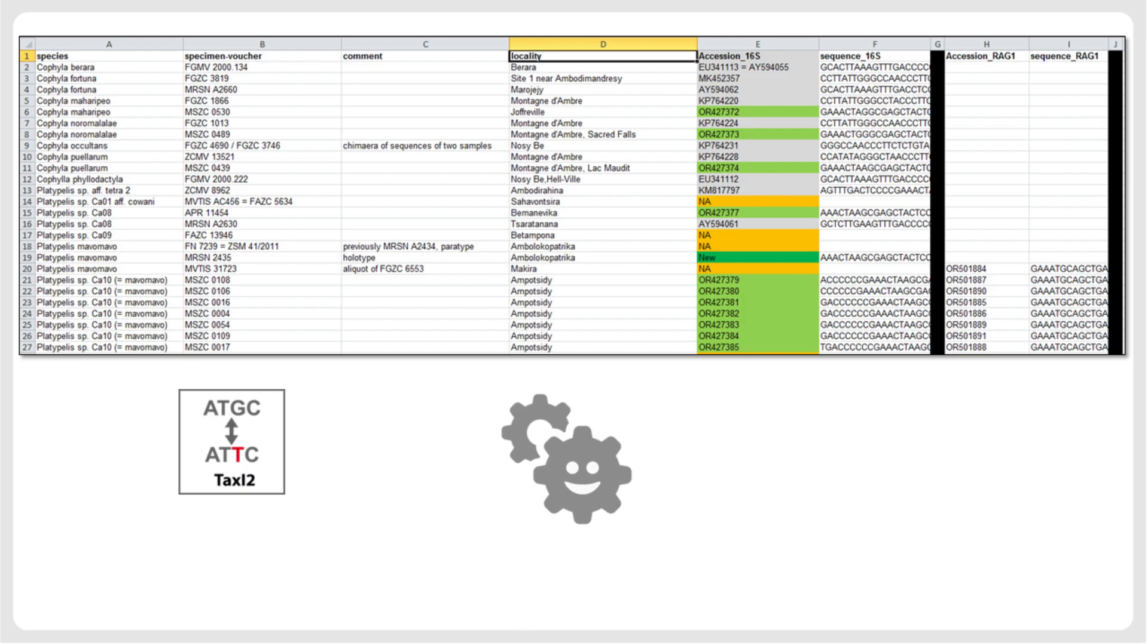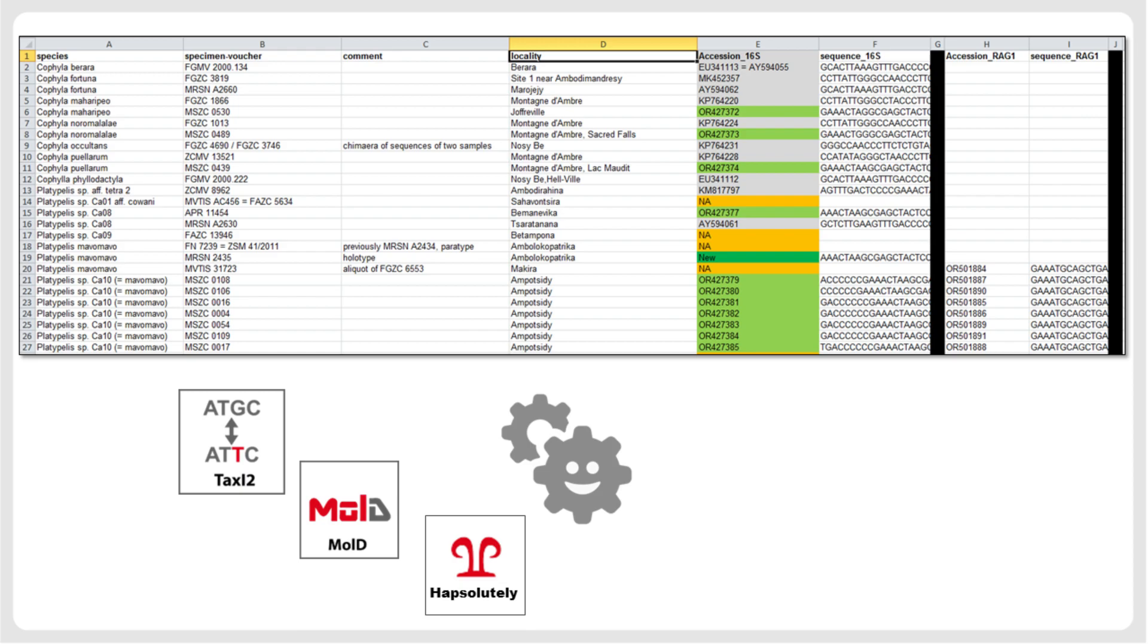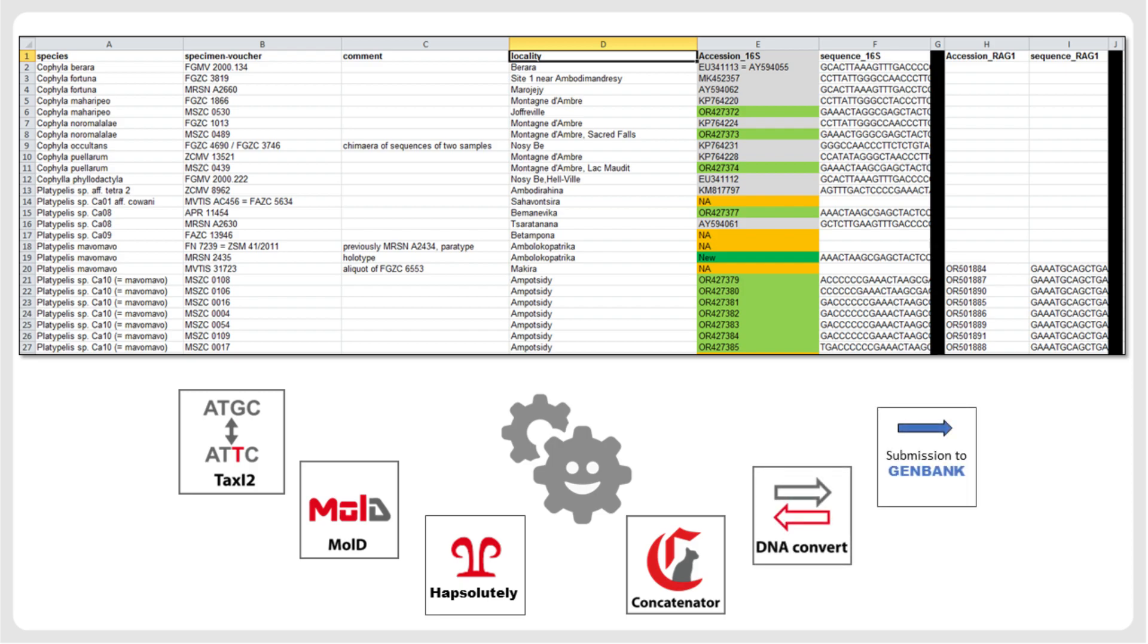Or you can use MOLD to infer diagnostic nucleotide positions for each of these species, or Hapsolutely to draw haplotype networks where alleles are colored by species. If you have columns of sequences with different loci per sample, you can use Concatenator to create a concatenated sequence alignment for downstream analysis. If you organize your metadata according to GenBank source modifiers, you can use DNA Convert to convert the sequences into a specific FASTA file for sequence submission to the GenBank database.